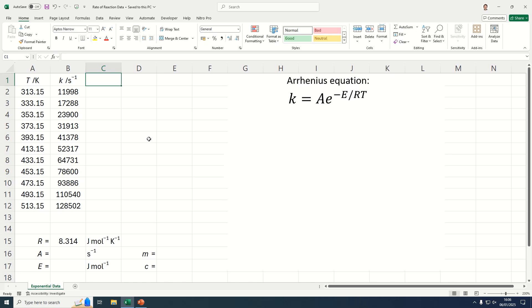In this video I'll show you how to linearize rate of reaction data. So here we have the chemical rate of reaction for a first-order reaction at different temperatures.